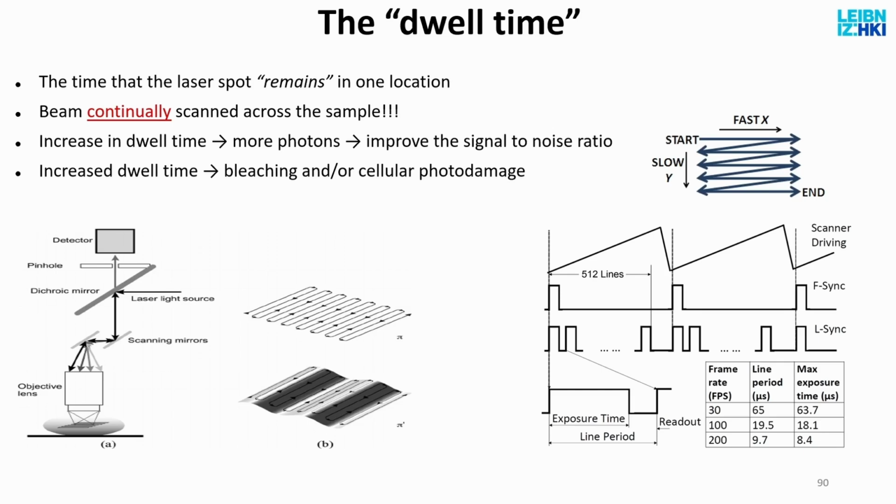I know the scan speed. I mean, you have to know this, but the computer software, the microscope software, knows. If you say, I want my pixel to be 100 nanometers, then what it does is it checks the scan speed, how fast you set up the mirror, which is moving from left to right. And says, okay, it's moving from left to right in 2 milliseconds.